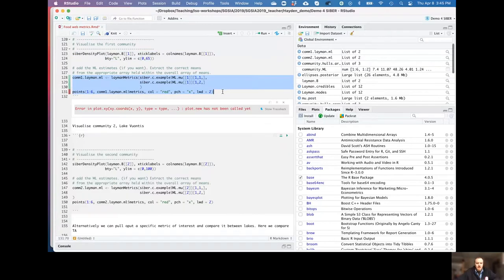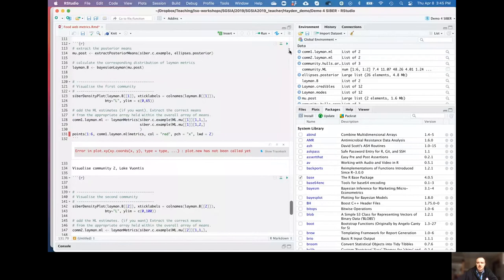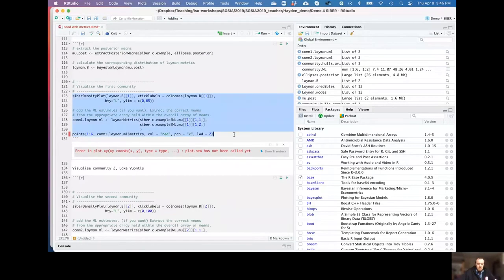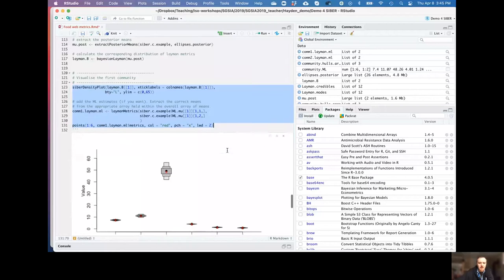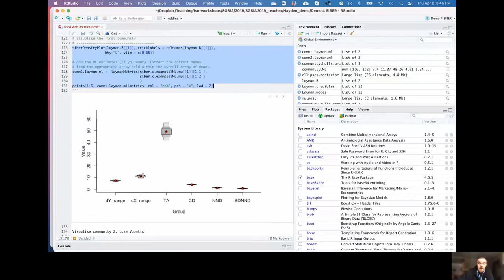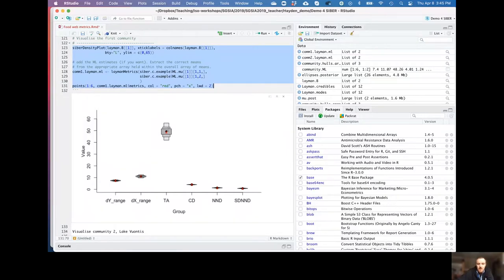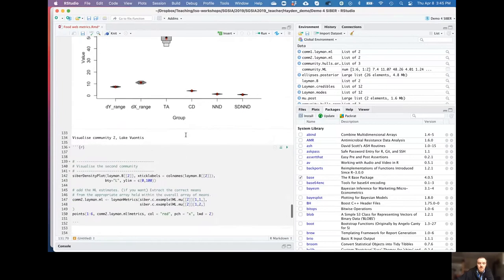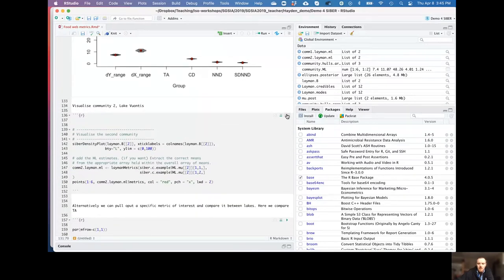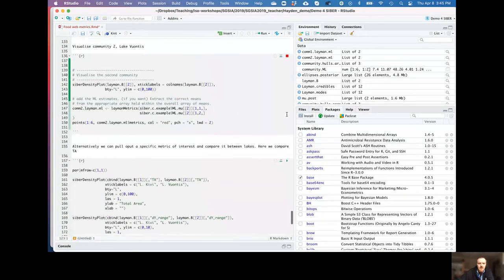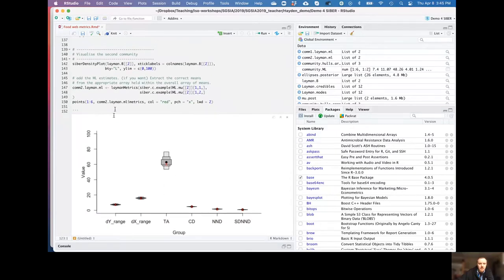So now we've got this estimate of error that we can use to estimate whether one thing is actually larger than the other or not. And as before, we should be able to add the estimates from the non-Bayesian approach to this. And like we said, they should fall very close to the mode values. And what we can see here is that they pretty much do. So again, we've gotten confidence here that everything is working pretty much as it should be. We're going to run the exact same thing here for the next lake. Now we've got Lake Vauntas, pretty similar values.